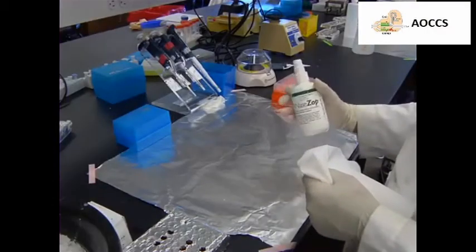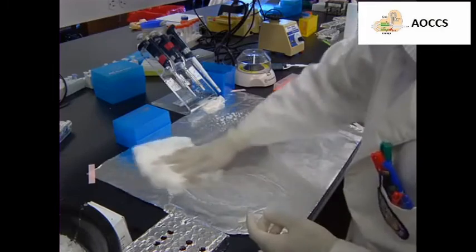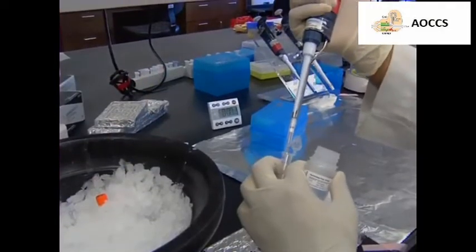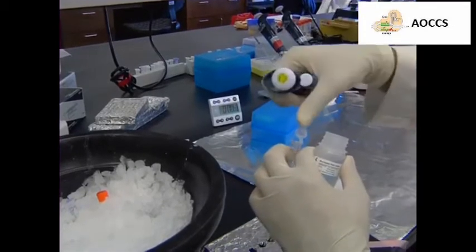First, spray the working area and pipettes with RNA Zap. To begin cDNA synthesis, dilute the template RNA samples to a concentration of 5 ng per microliter with nuclease-free water.